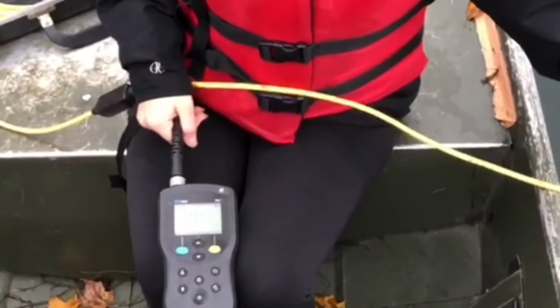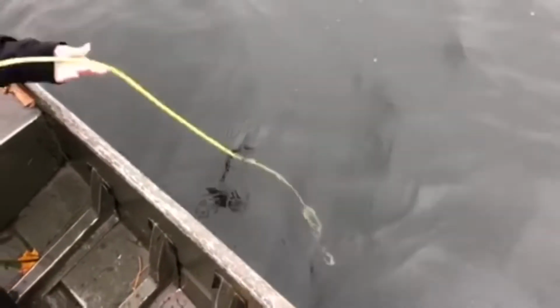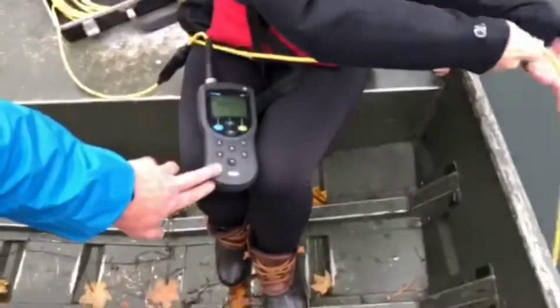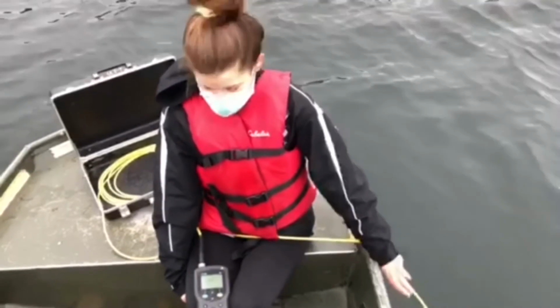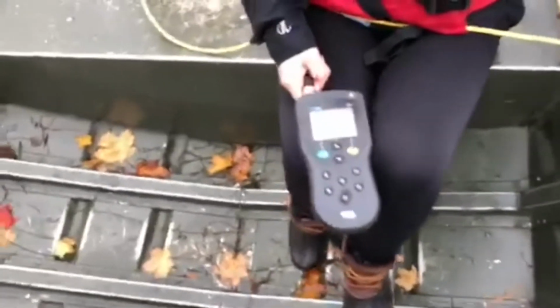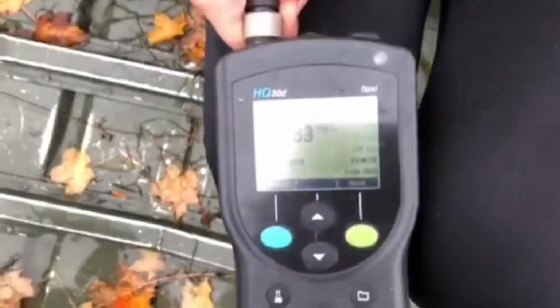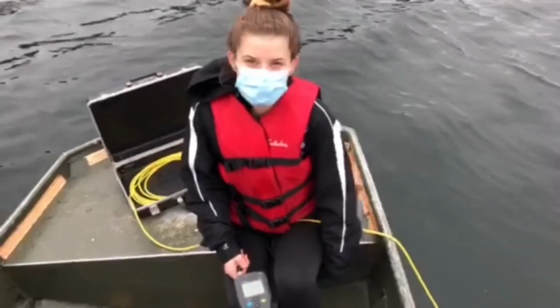until it stabilizes. Since we're moving a little bit, it's not going to stabilize all the way, but as you can see, it's about at 9. Now I have the probe at about 6 meters underwater, which is about 20 feet, and as you can see, it's very similar to what the dissolved oxygen was at the surface of the lake. Similarity in dissolved oxygen is due to the turnover of the lake.